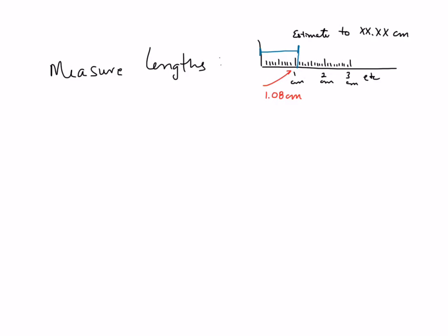So things that you're going to need are pretty much over here. The blocks are over here. I don't care what you call length, width, and height, okay? But this is what you're going to write down on your data sheet. So your rulers, if you're like me, I always have to concentrate when I'm working with rulers. So orient yourself. You're going to be using the metric side, okay?